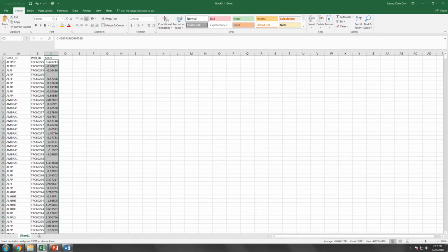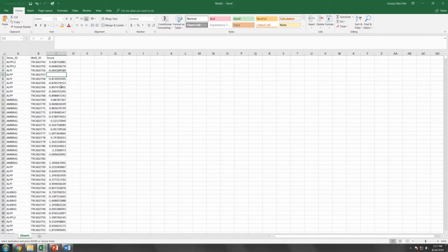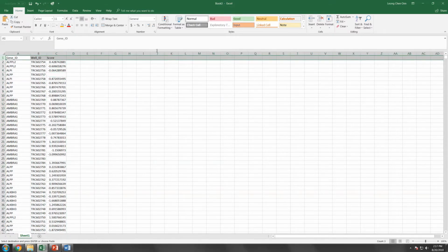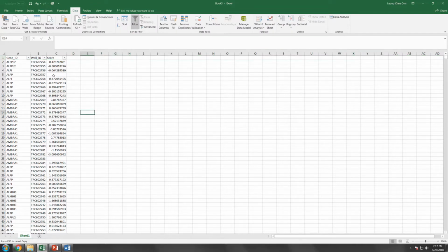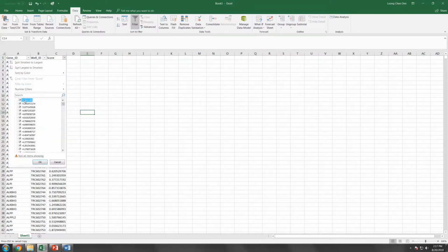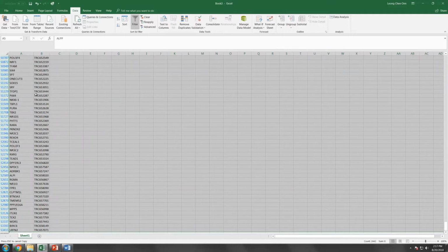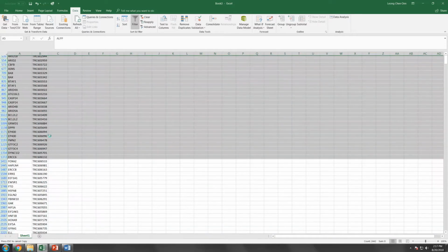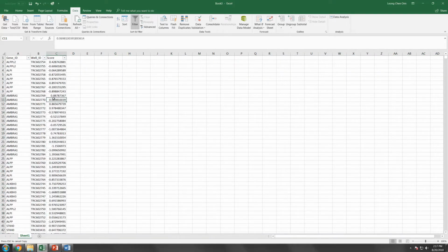Now, you will see that some of the Z-scores have a blank value. For RSA to work, you will need to remove those blank cells. Basically, I'm going to select the blank cells, and then delete all these rows. Okay, now you should have all the data ready.